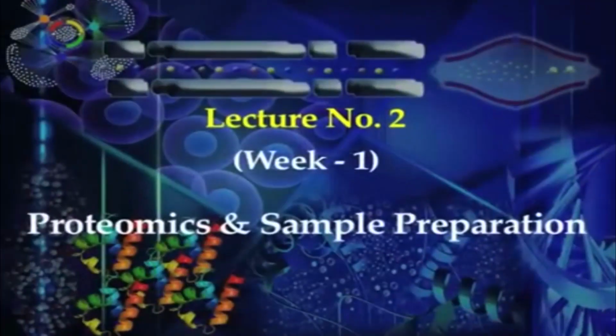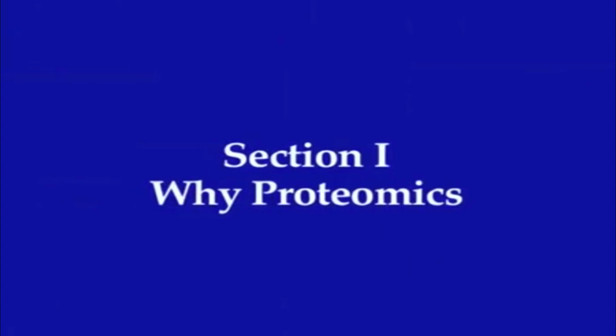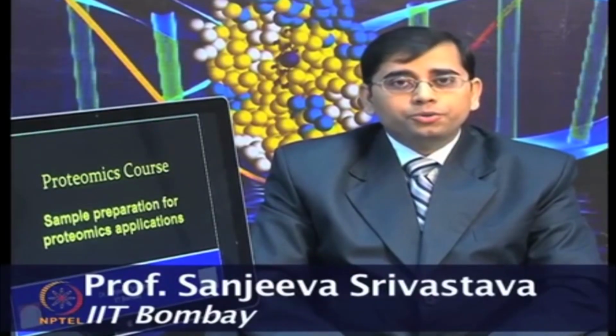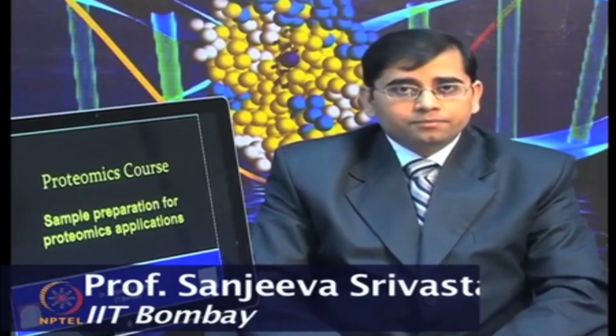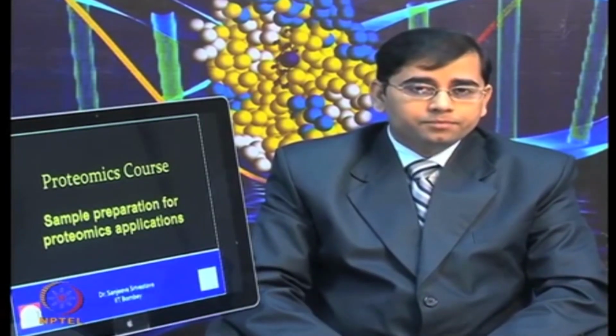In today's lecture, we will talk about sample preparation for proteomics applications. As you know, a very good sample is essential to perform any good experiment, and especially when you want to characterize thousands of proteins in a given experiment, it is very essential that you start with a very good sample.